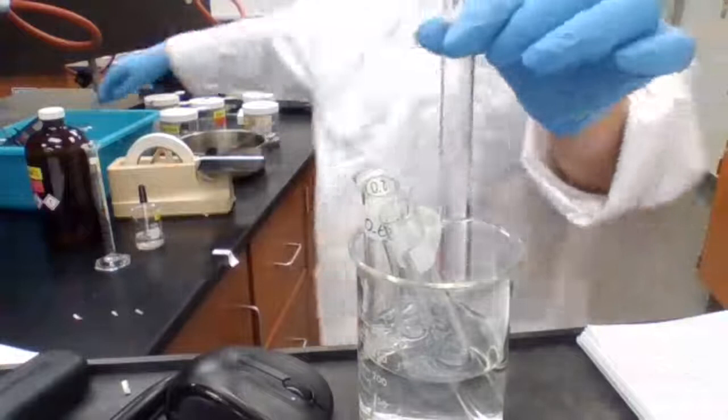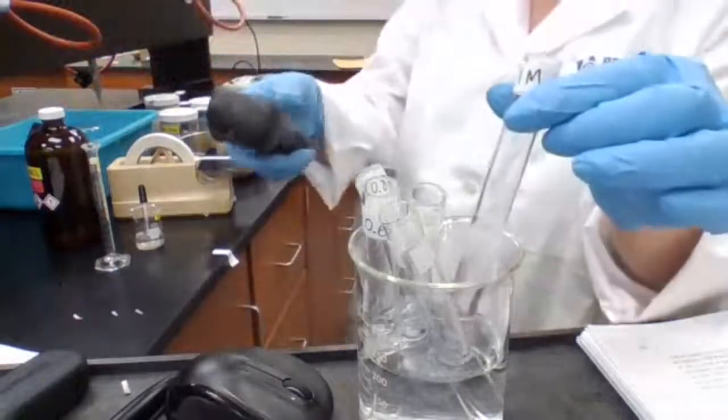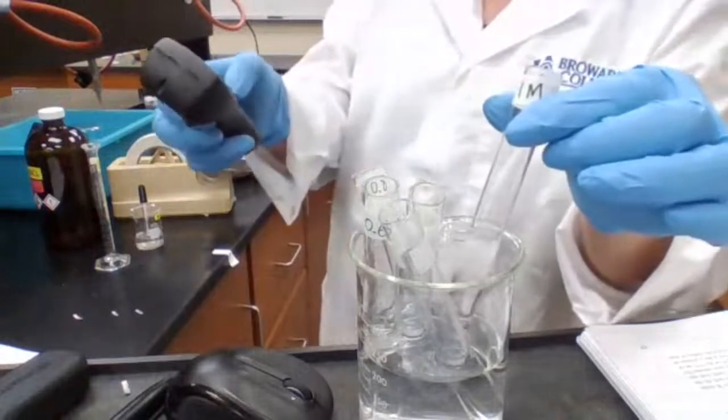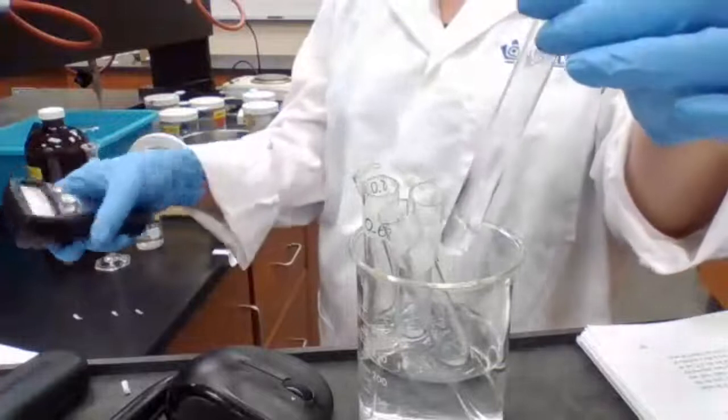I'm waiting to see how long it takes for it to dissolve completely. It has to dissolve completely.